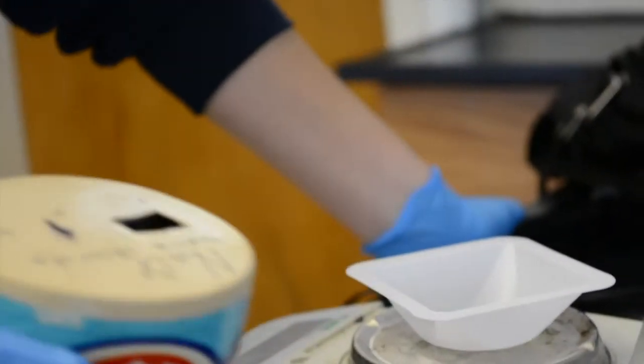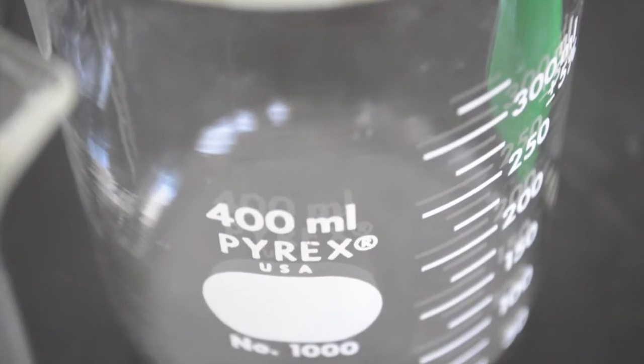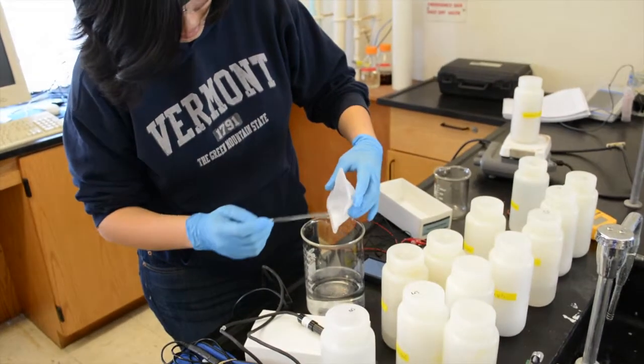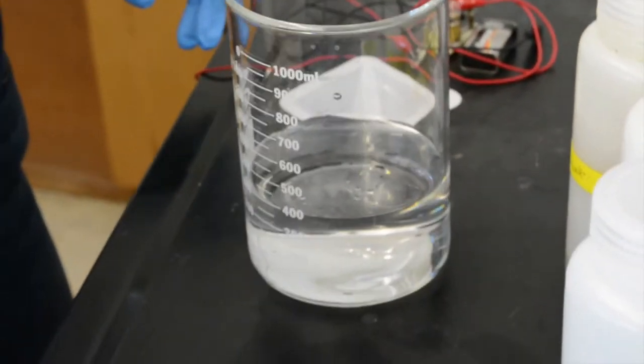To find the conductivity of the snow samples, a standard of conductivity was created by using 400 milliliters of distilled water and adding 0.1 grams of sodium chloride, also known as table salt, then stirring for 1 minute to dissolve the solvent in the solution. The solution was then left for 2 minutes to allow the solution to stabilize.